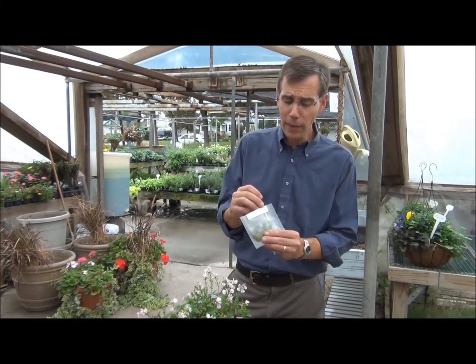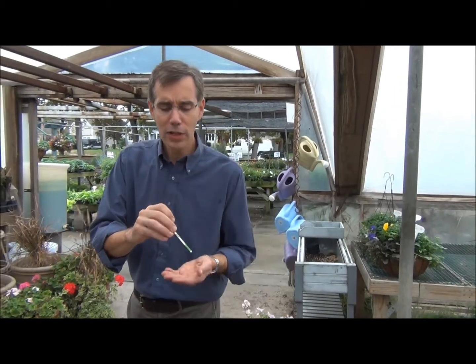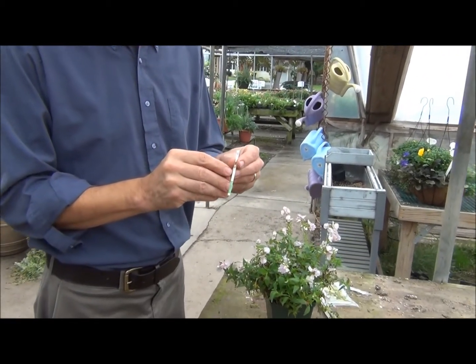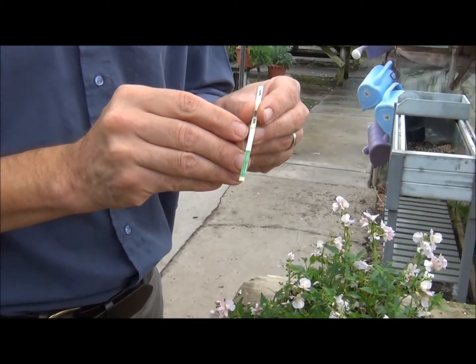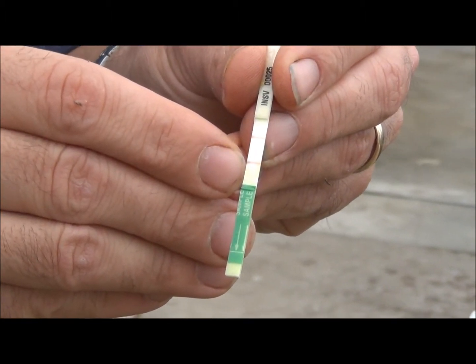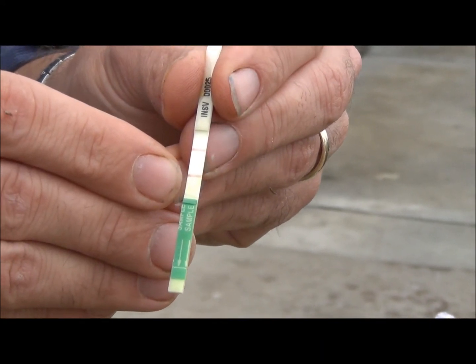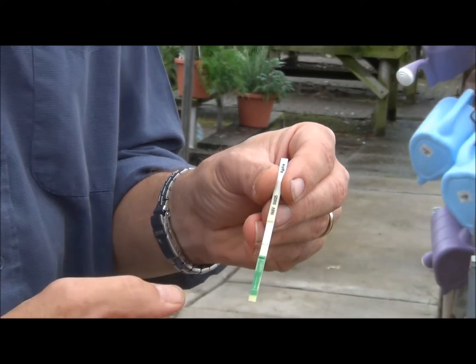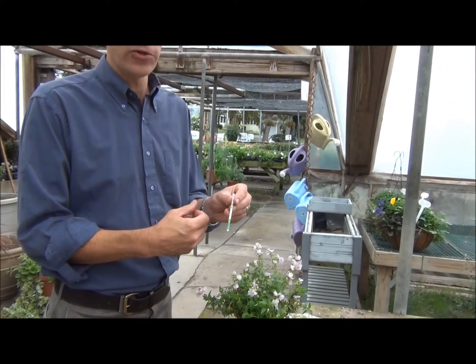After about five minutes we're able to read the results, and in this case it was positive. We have the control line at the top, and that's just telling us that the test is working — that's there whether the plant is positive or negative for the virus. And here we have the indicator line, and that's saying that this plant has impatiens necrotic spot virus. These test strips cost about four to five dollars each, and they're normally bought in a multi-pack.